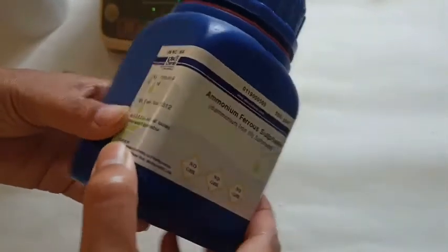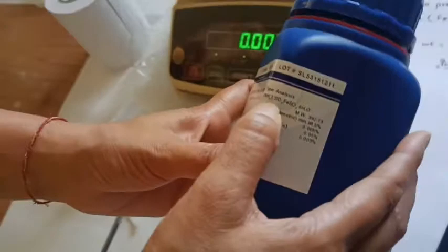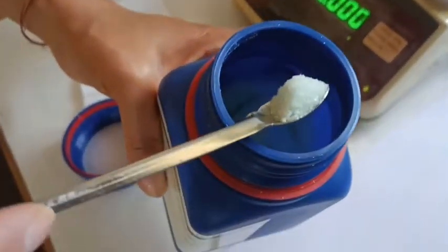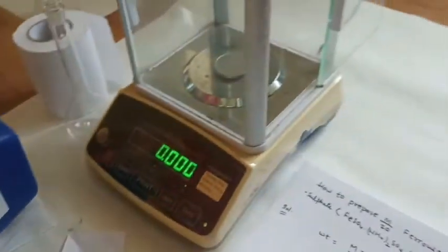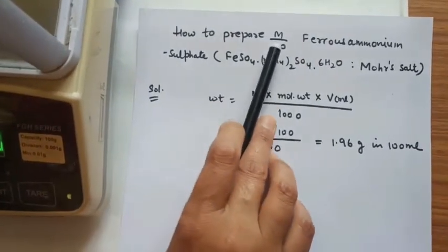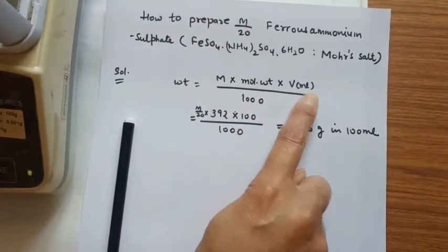Now we are preparing the solution of ferrous ammonium sulphate or Mohr's salt. Its molecular weight is 392. This is its formula: (NH4)2SO4, FeSO4 plus 6H2O. Let me show you how it looks. So it is light green. You can see this is not white, it is little greenish.